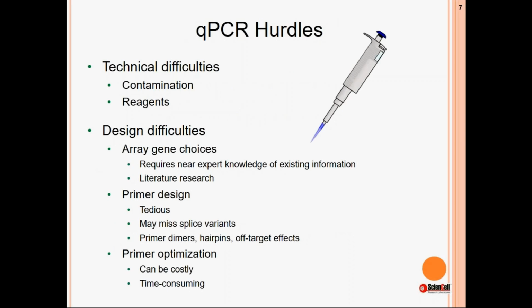So why isn't everyone using qPCR? I do not know, but I suspect it's because designing and optimizing an array can seem a little intimidating. Because it's so sensitive, it seems easy to compromise your experiment unintentionally, and it actually is rather easy. But I'm going to take the time now to tell you about common qPCR errors so you can avoid, detect, and correct them in your future.